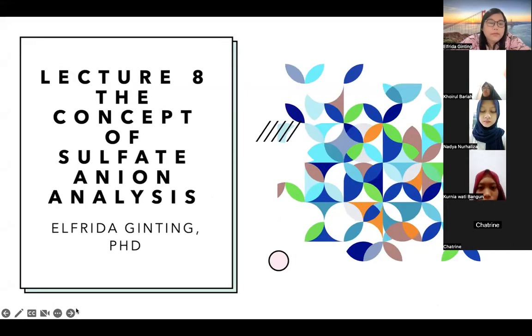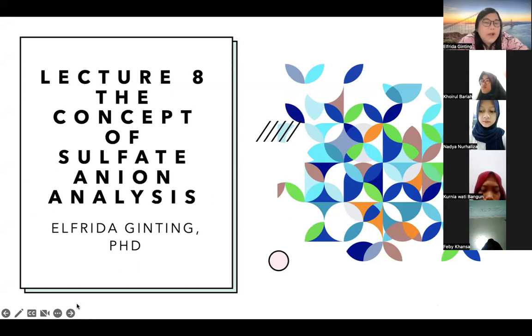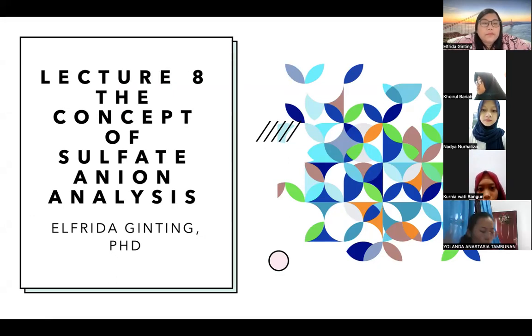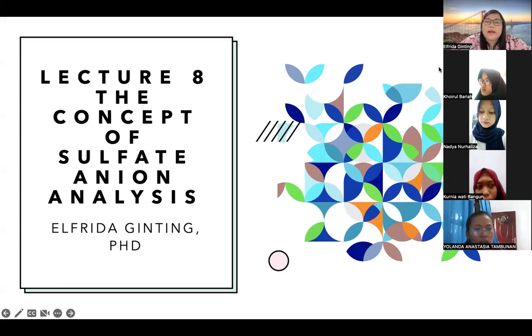Okay, I'm doing my introduction in Indonesian, with Bahasa. Now I'm changing into English again because you guys are in a bilingual class. Now we are in sulfate anion analysis. Okay, we are already in sulfate anion analysis, and let's see which anions are categorized as the sulfate group.